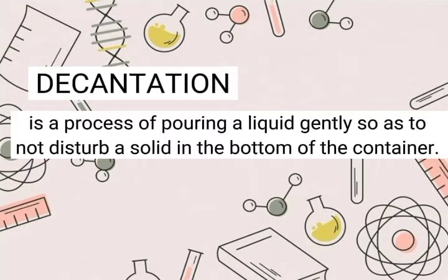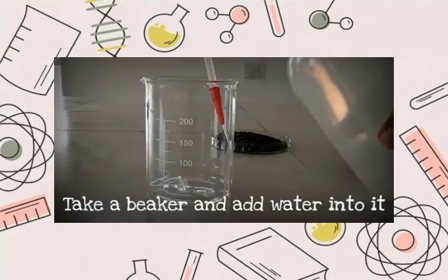So let's proceed to the decantation. Decantation is a process of pouring a liquid gently so as to not disturb a solid in the bottom of the container. So here are some examples of decantation.